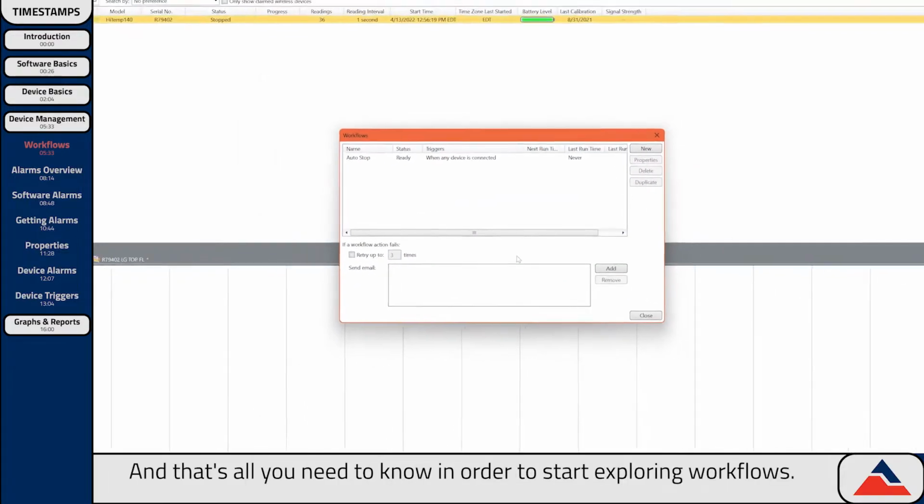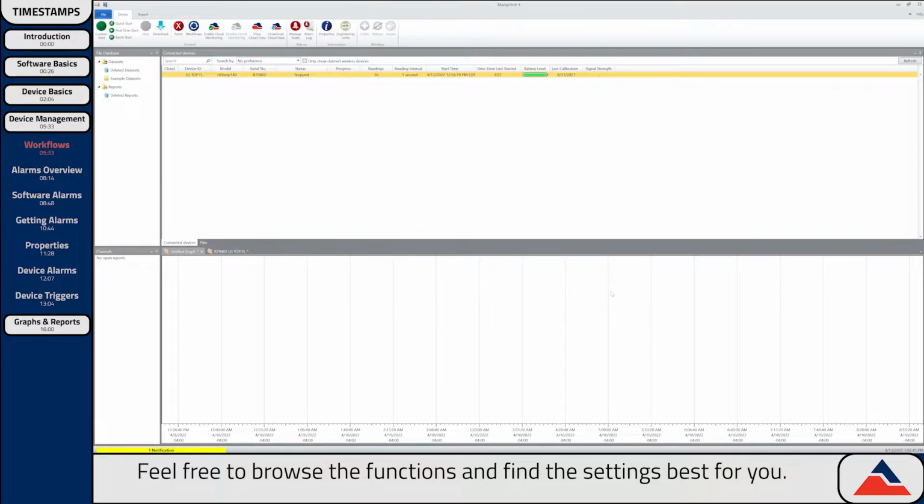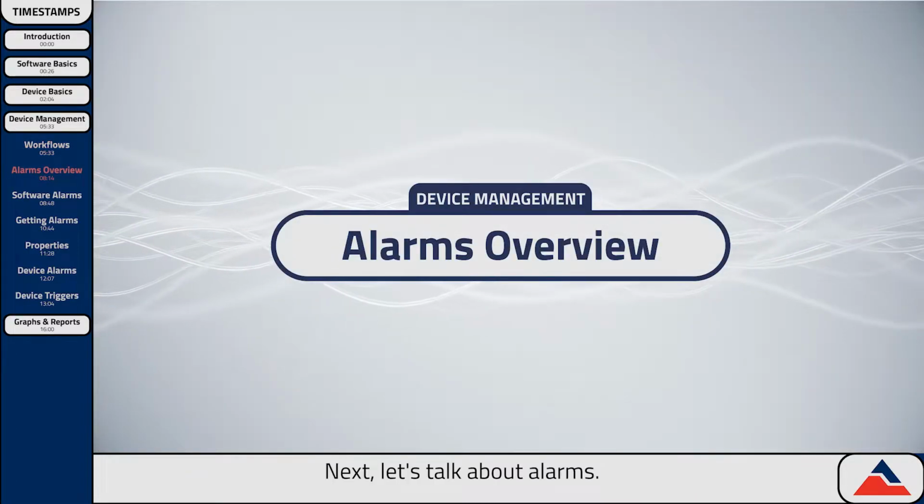And that's all you need to know in order to start exploring workflows. Feel free to browse the functions and find the settings best for you. Next, let's talk about alarms.